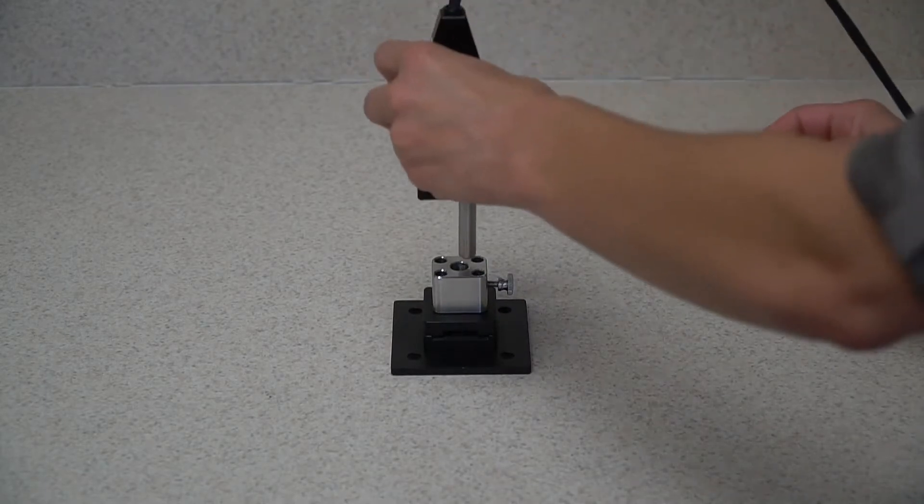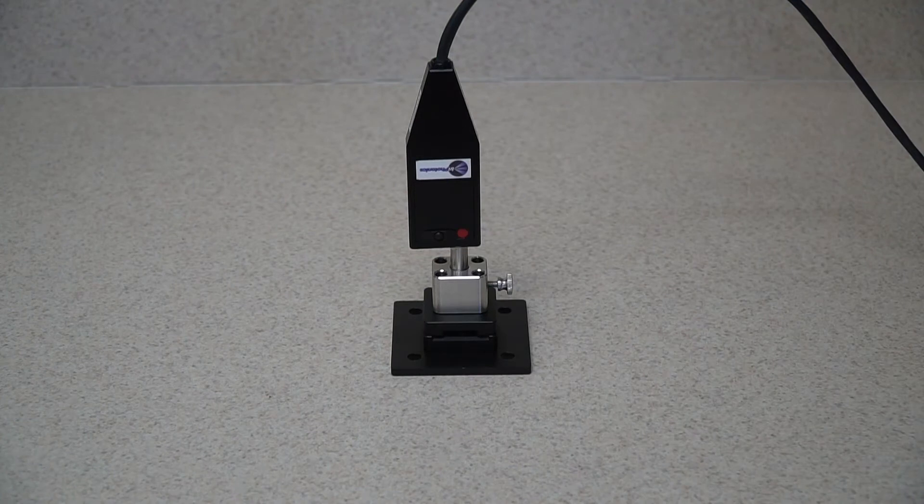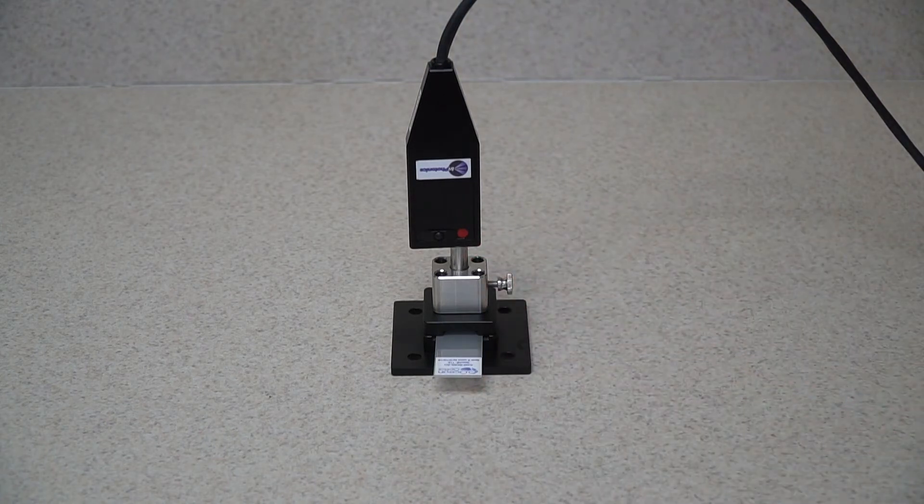Insert the Raman probe into the top of the holder. Turn or hand tighten the screw on the side to hold the probe in place. Insert the SERS substrate slide into the slide opening on the bottom of the holder. Your holder is now ready for the Raman measurement.